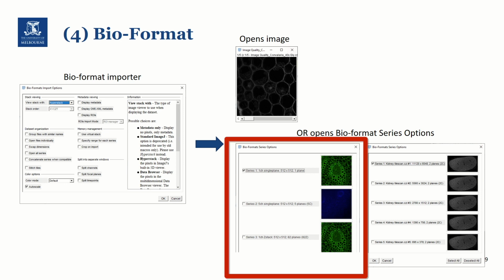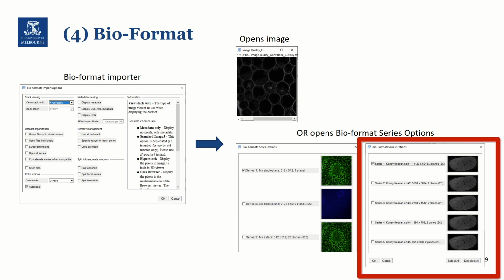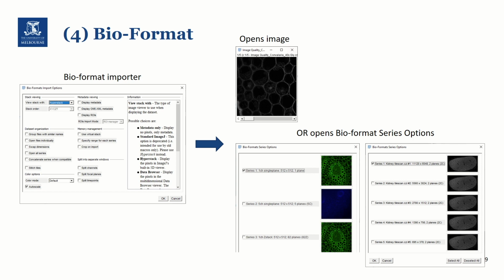A microscopy file format like LIF contains many different images, so this will show different images in the list. Another format like the Zeiss microscopy format will store a large dataset in a series of different resolutions, so this will show the same image in different frame sizes in the list. Either way, we can add this Bio-Formats importer into our script, so we can run the batch automatically without manually selecting these options.